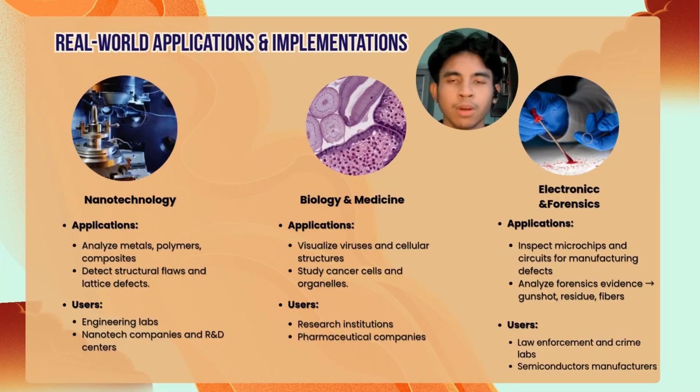So I'll be talking about the real world applications and implementations. We have three career paths, which are nanotechnology, the second one is biology and medicine, and the third one is electronics and forensics. So the application for nanotechnology is that it analyzes metals, polymers, and composites. They study materials at the atomic level and molecular level, and it also detects structural flaws and lattice defects. The users of nanotechnology are engineering labs, nanotech companies, and R&D centers.